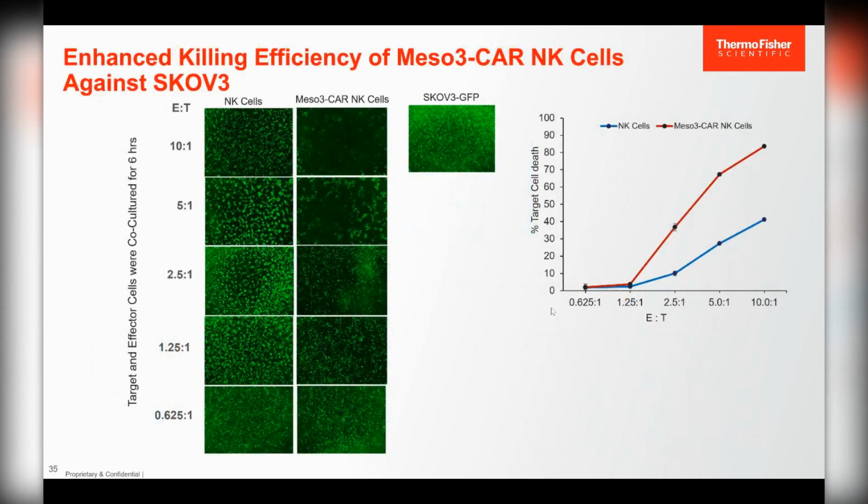However, we can see we developed the CAR NK, and over time its expression increased. We can see the viability: the cells are more viable and they maintain their phenotype. For the endpoint, we are interested in seeing the functionality of the developed CAR NK.